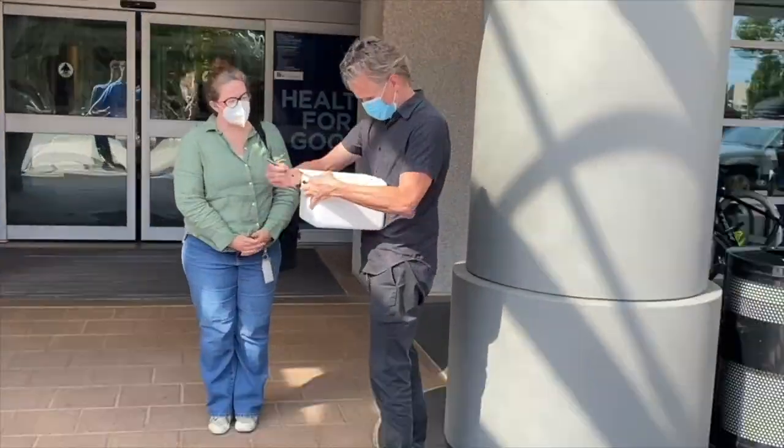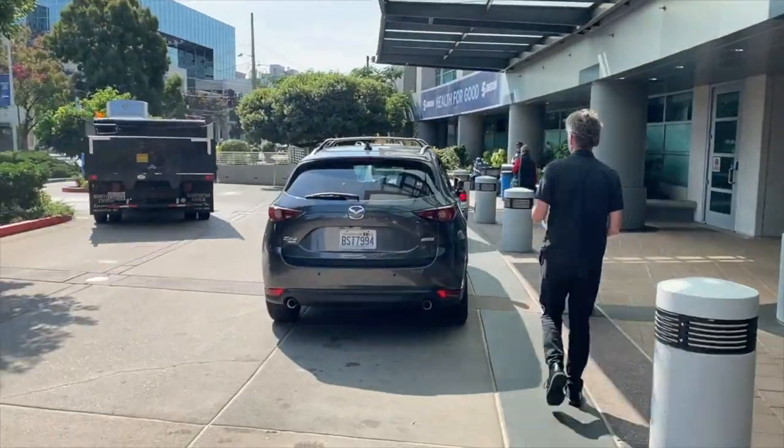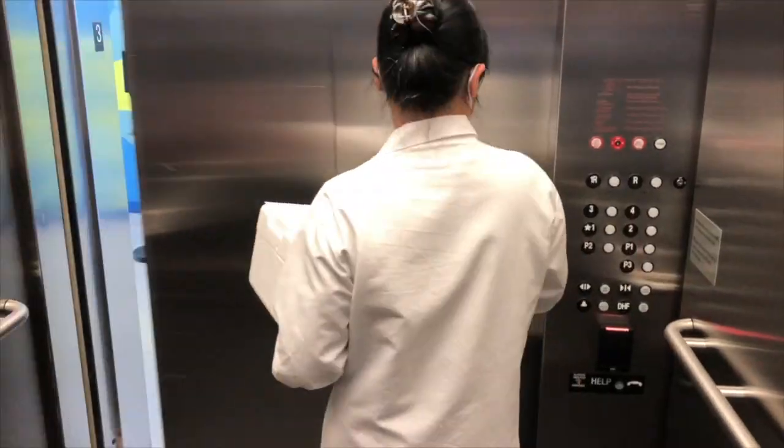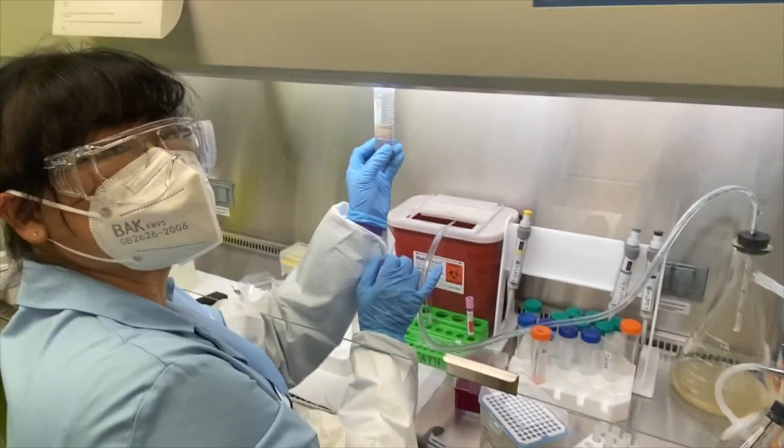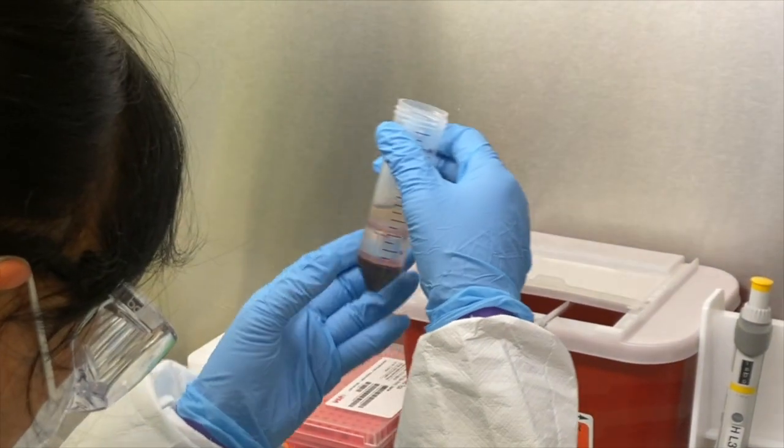First, we get called when we're told that a patient is coming in to get a blood draw. And then we have operators standing by to take the blood that's drawn in the clinic, and immediately that blood is couriered to the ISB. Then that blood goes into a blood processing facility. There's several processing steps. We have to centrifuge the blood, we have to separate the plasma, we have to separate the cells. A critical aspect of this is that if you don't do this quickly, all of the molecules and all the cells that we care about will degrade.